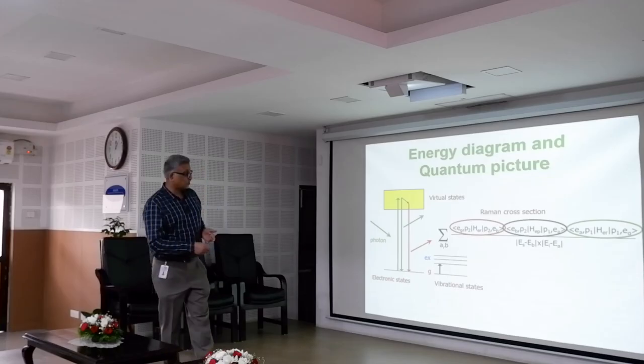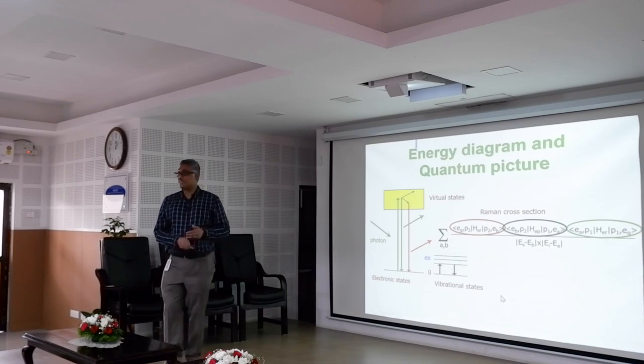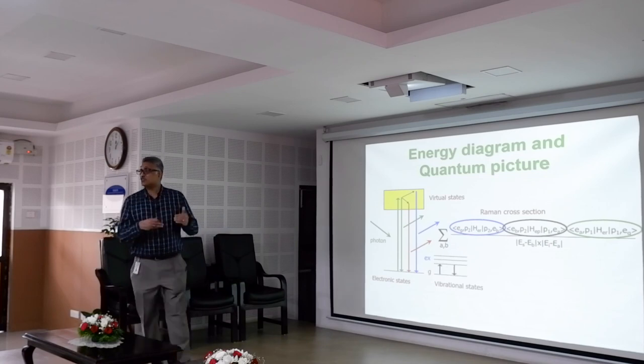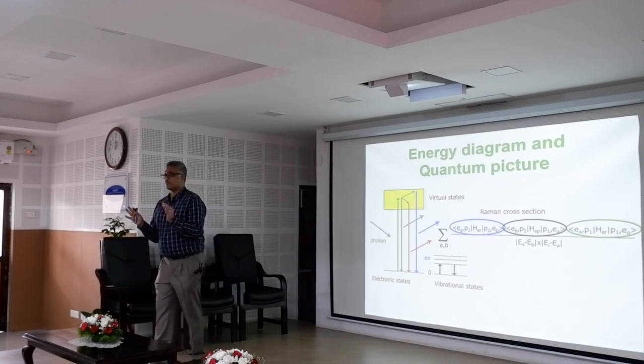The reverse is also possible, that you can have an excited vibration state giving energy to the electron and coming to the ground state. Then the energy of the electron will go up, and when it comes down, it will be blue shifted. Right? Now, these two processes are what the Raman effect is. So it's the vibrational coupling, and now it's the quantum mechanics I was talking about.